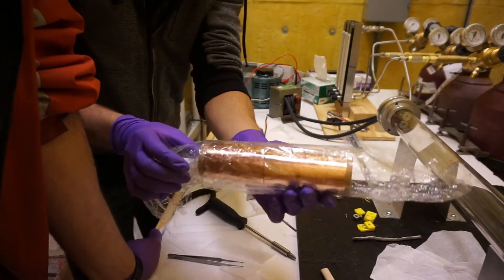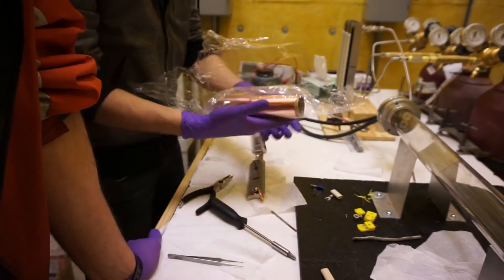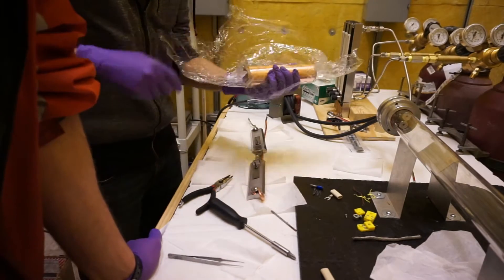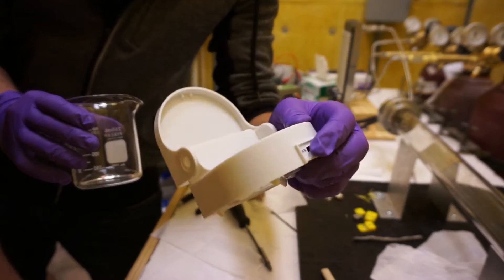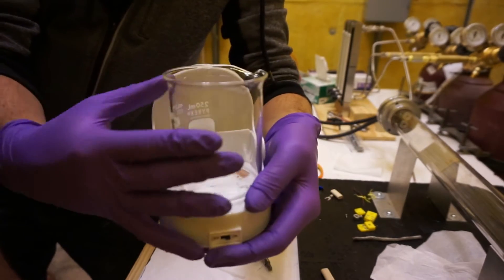Here is the copper foil that will catalyze the reaction. We clean it in our super legit denture cleaner sonicator - works like a charm.